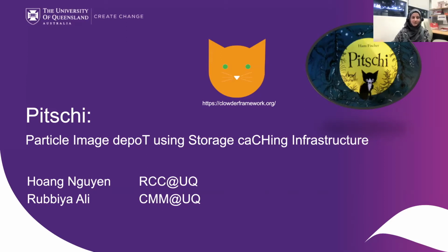So today's talk is about this metadata repository framework, which we are trying to establish at CMM for UQ instrument. So we named it Pitschi because it's basically an extension of Clowder, which is the group of cats. So our tiny little cat is Pitschi, which is really cute, and she wasn't happy her whole life because she was a kitten, and she went through so many adventures, and at the end she was happy because she found that's the best way she can live.